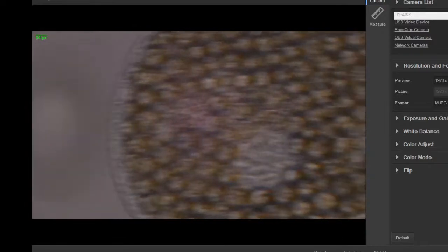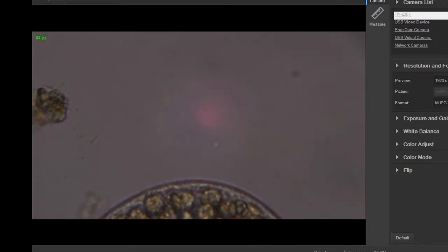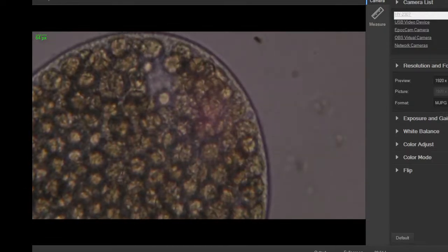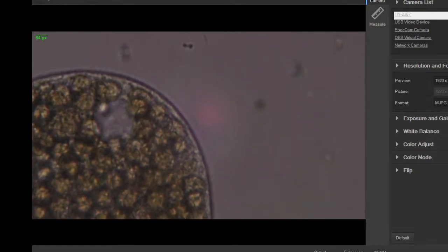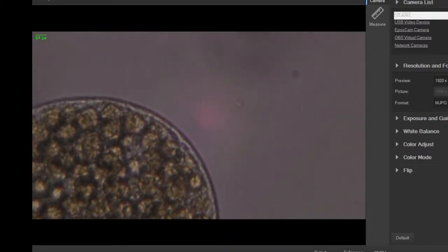So we'll go back to the back of the cell. You can see that area I'm talking about. Well, back in the way it's moving the other direction, but you can see that section right there in the middle of the frame. It's kind of light colored, gray. Watch it expand, and then watch it contract. There you go, as it pumps out that water.